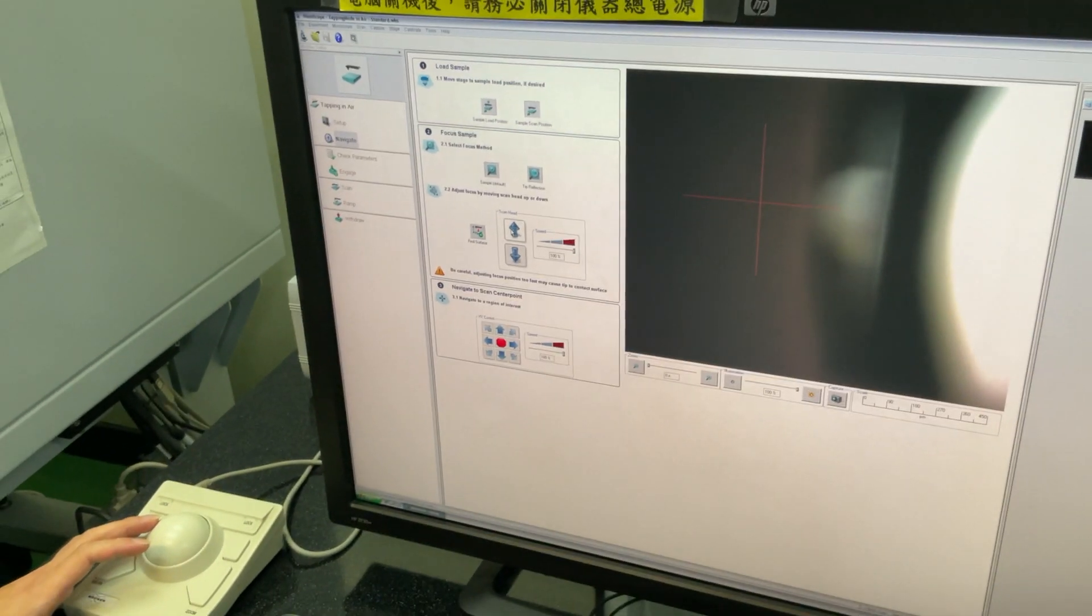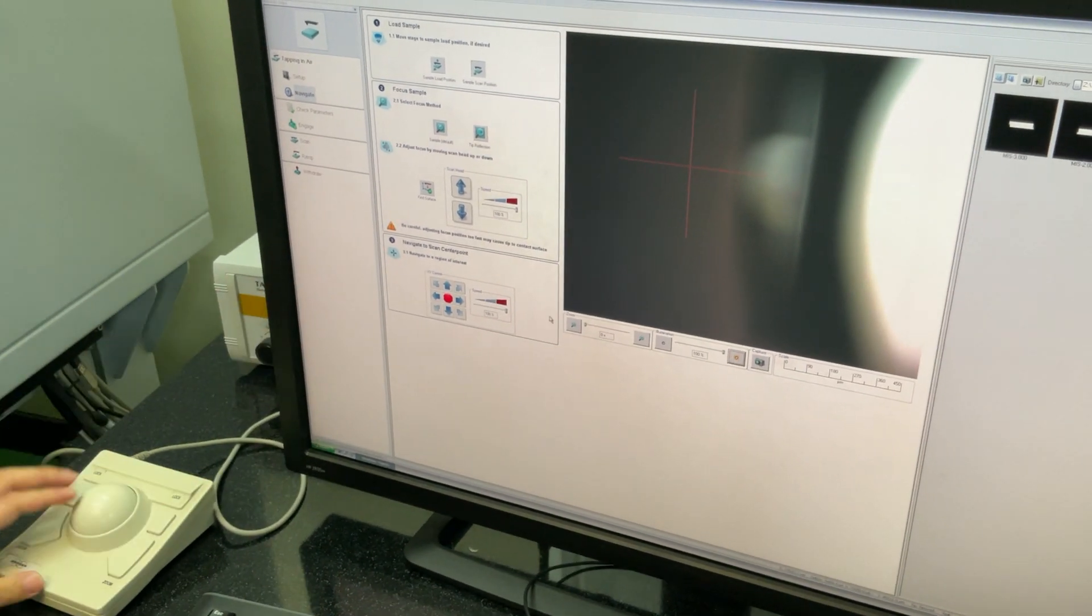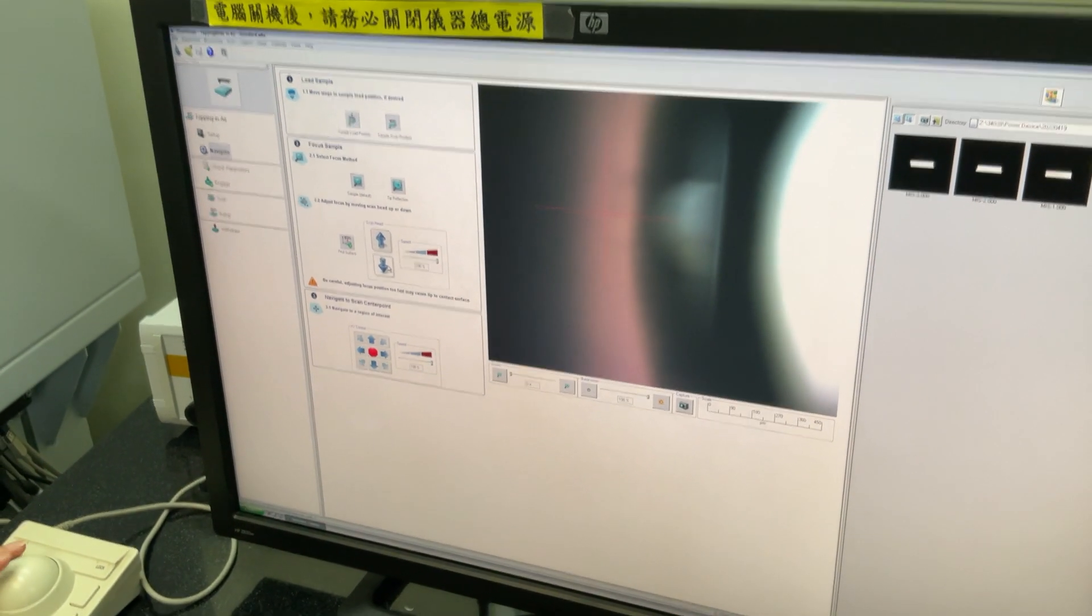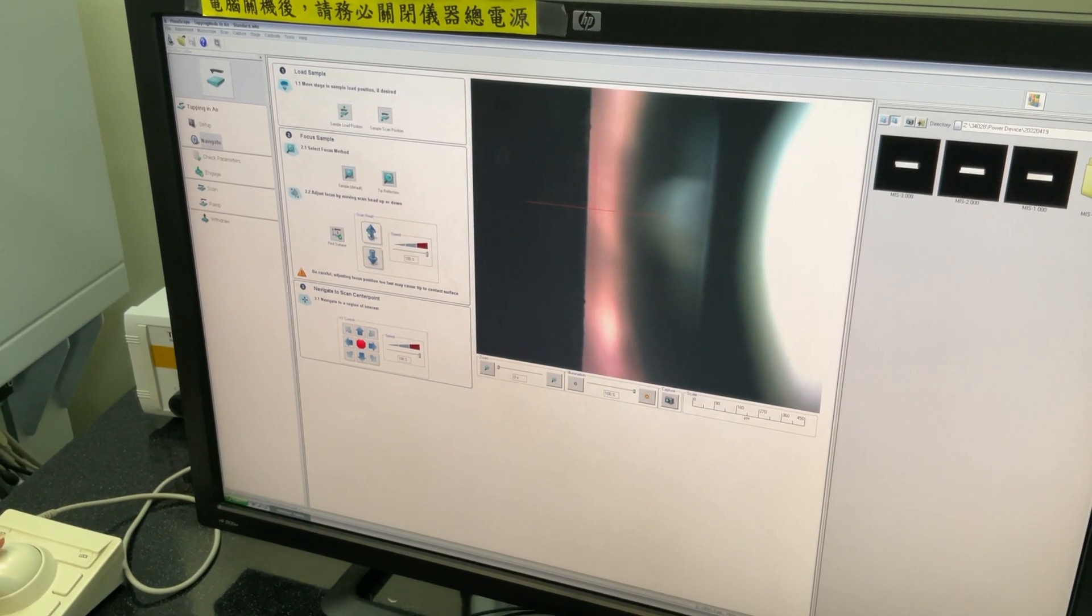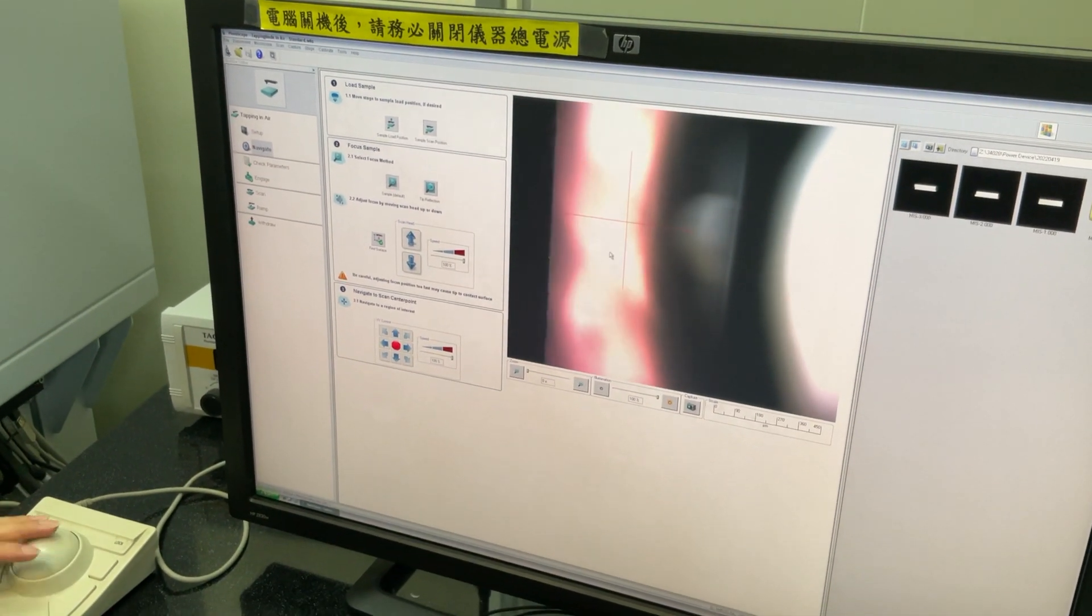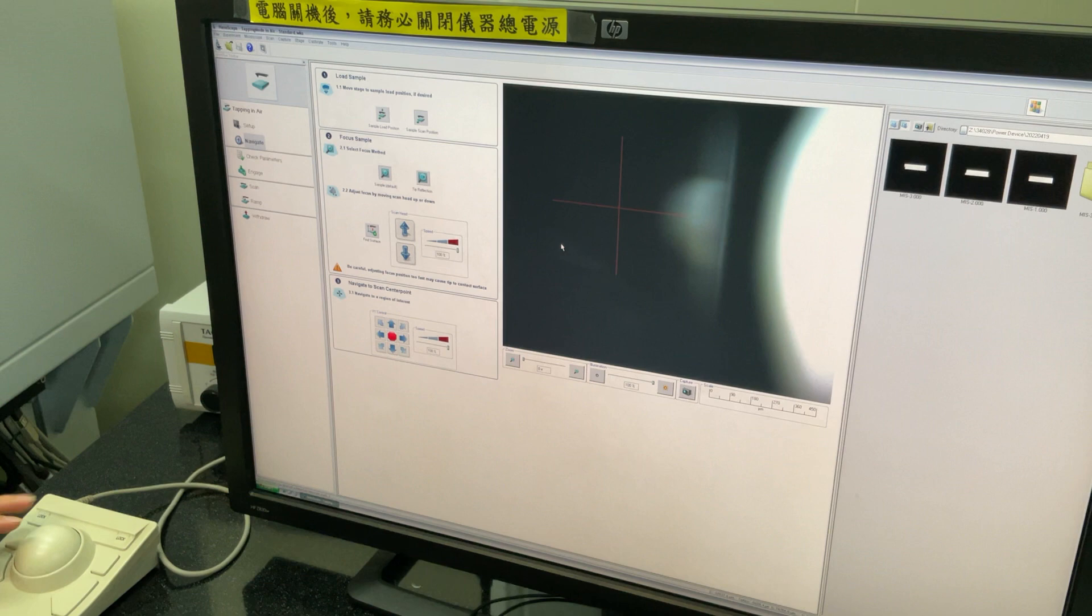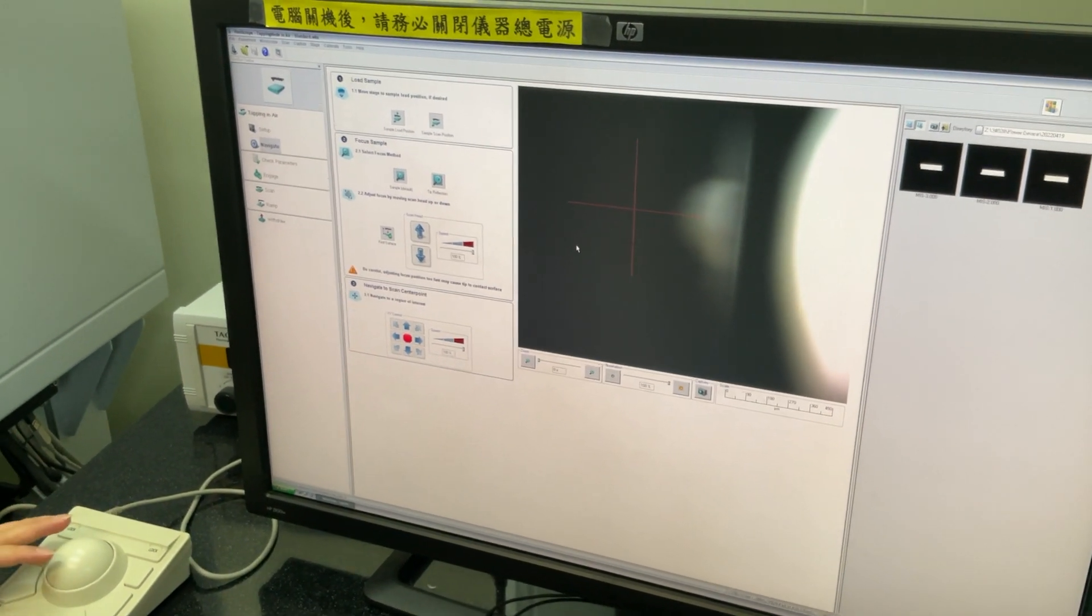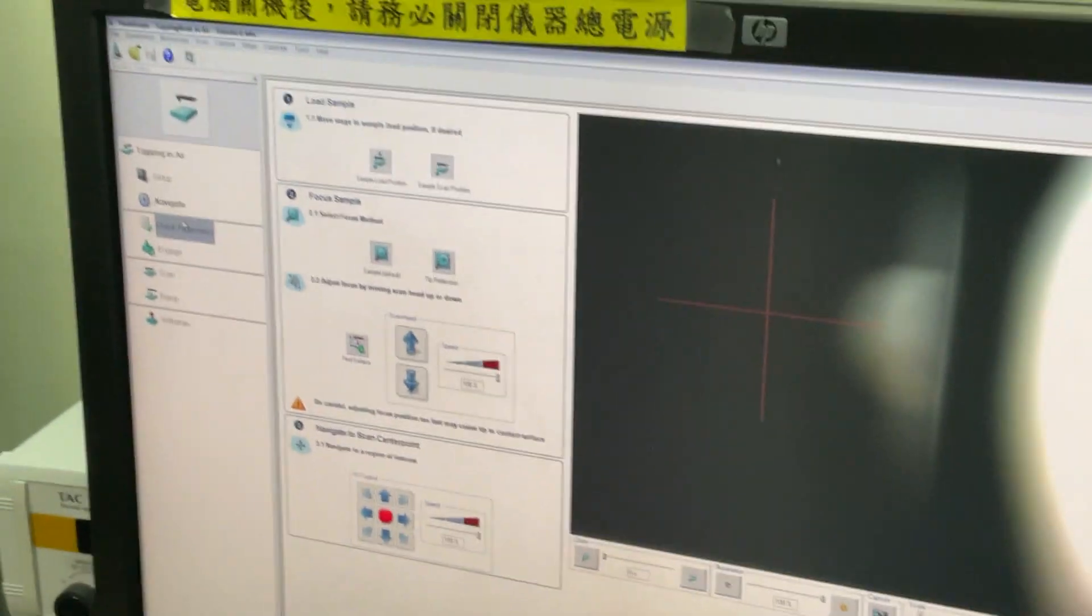How is the structure called nanowire? Nanowire. Is it okay to scan nanowire sample? Focus to your sample and we need to choose where we want to scan. So just move this way. Maybe that was here.